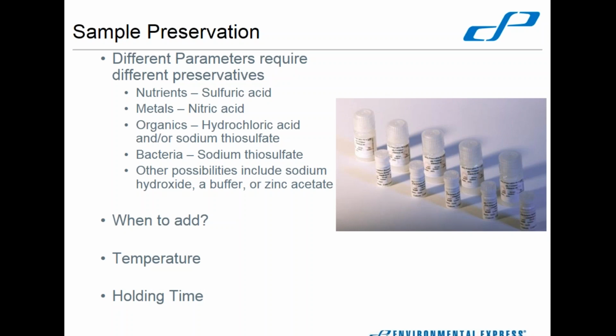to the lab, because sometimes you'll need to have individual aliquots for your nutrients, for your metals, maybe for your BOD, for your bacteria, and for cyanide. So you've got all these different things that you're pulling samples for, but they all need different preservatives. So you don't sample into a preserved gathering collection container, but once you have completed your sample, you then pour into different bottles, and then that's when your preservation gets added in.